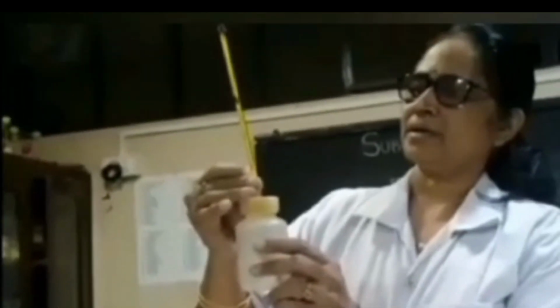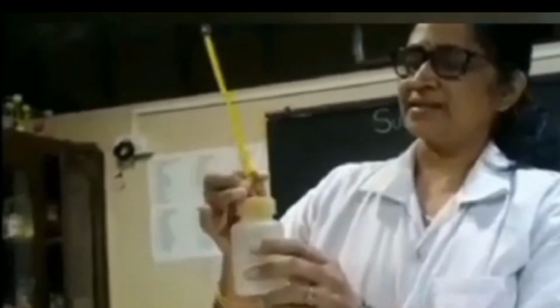Now let us see what the temperature is here. The initial temperature of HCl is 27 degrees Celsius. Okay, this is the initial temperature of HCl.